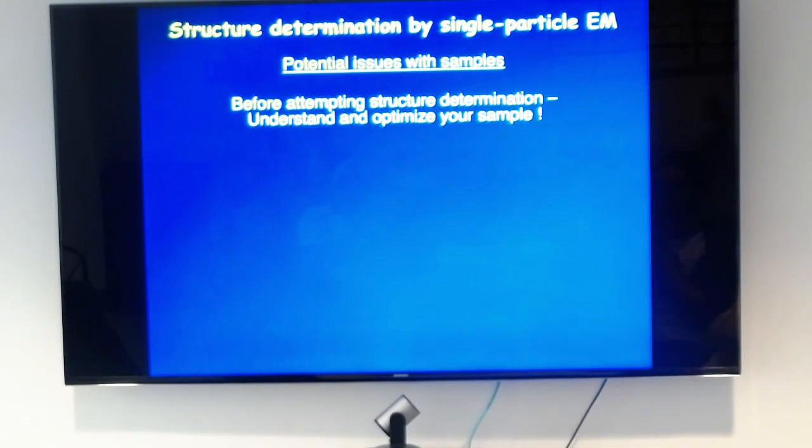My honest belief is any sample that you ever put into a cryo-electron microscope, look at it by negative stain electron microscopy. It takes you literally 5 minutes to make a grid, put it in the microscope, and see immediately what you have. So whenever you have a nice band on your gel and a nice peak on a gel filtration column, it means nothing. It's kind of like mass spec. Negative stain electron microscopy sees everything. Even if you have a nice band and a nice peak on a gel filtration, your protein can still have all kinds of different conformations. So it's a good idea to actually look at this by negative stain electron microscopy.